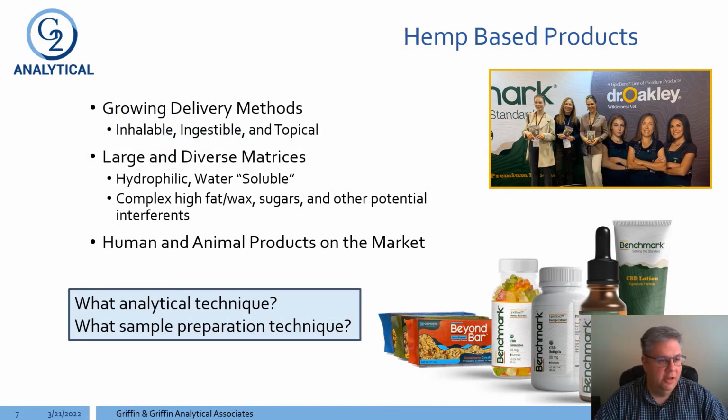Inevitably, you've all encountered some type of CBD product while you've been out and about in the retail space. There seems to be an ever-growing list of providers, offers, and places where you can buy these CBD products or hemp-based products. And while that's a good thing for the market, it does provide some challenges from a testing standpoint.